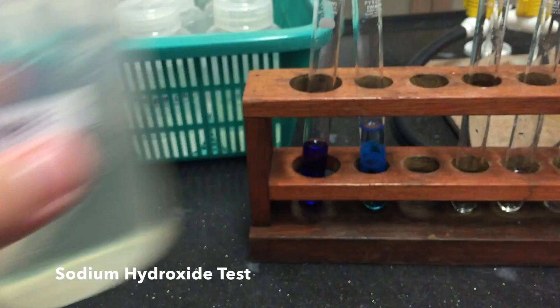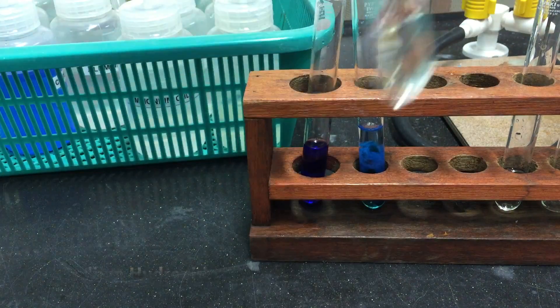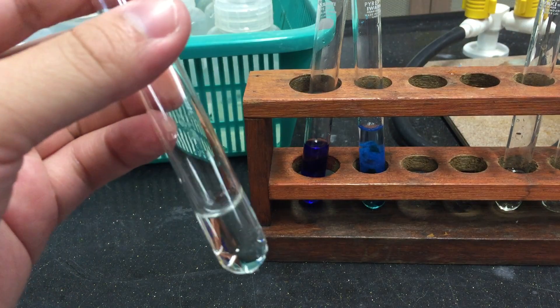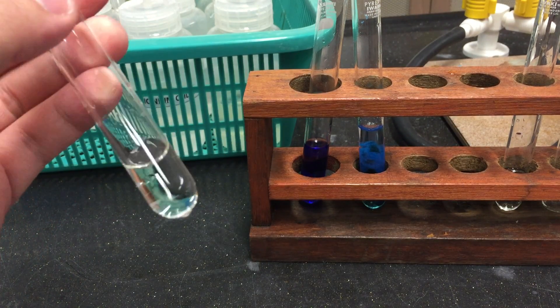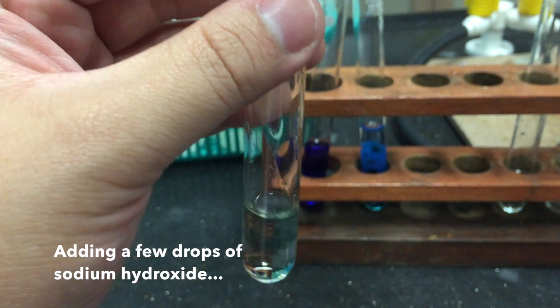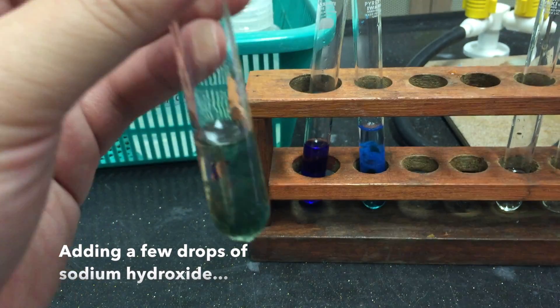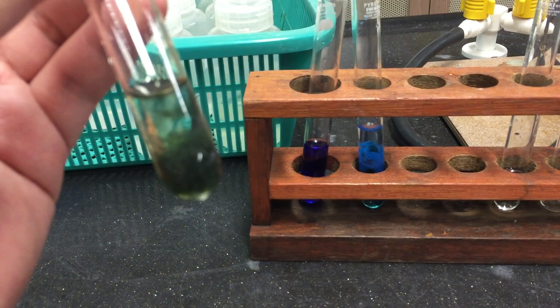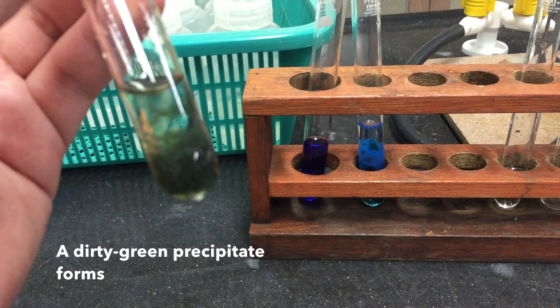First off, we may use the sodium hydroxide test to test for the presence of iron ions. To a small sample of your solution, add a few drops of sodium hydroxide solution. You will notice that a dirty green precipitate forms immediately.